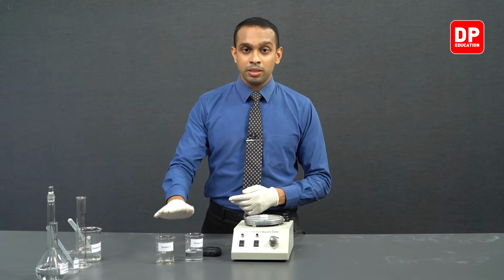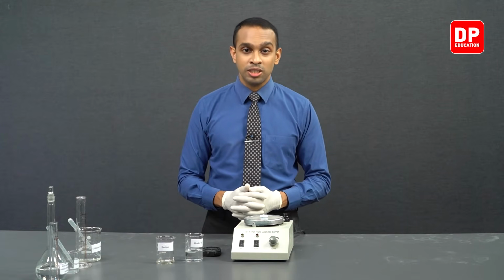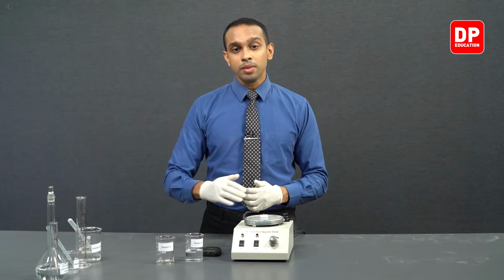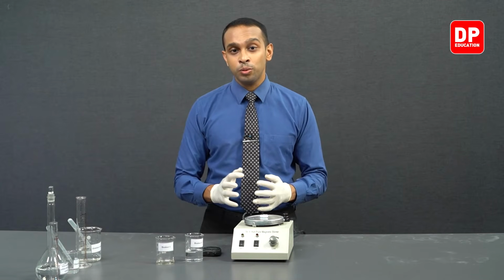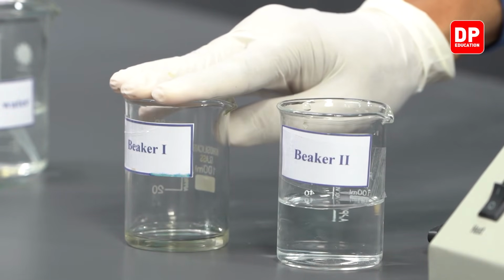However, in this particular scenario, since we have increased the concentration of sodium thiosulfate to 0.06, the amount of sodium thiosulfate in the medium will be greater than the amount of I2 that is going to be produced when only 5 milliliters of our Fe3 plus ion solution is added.